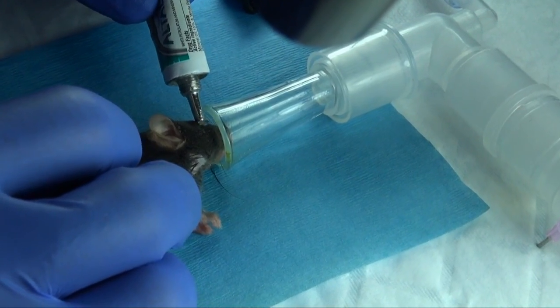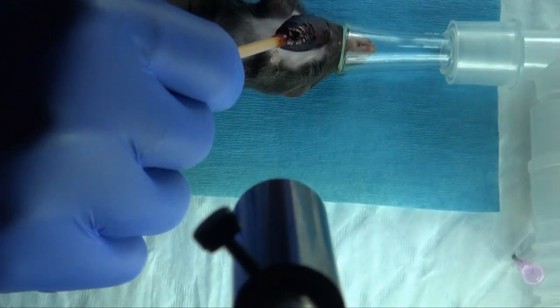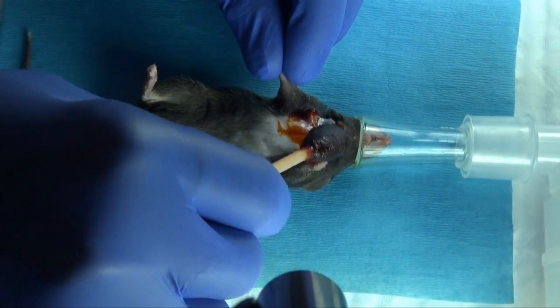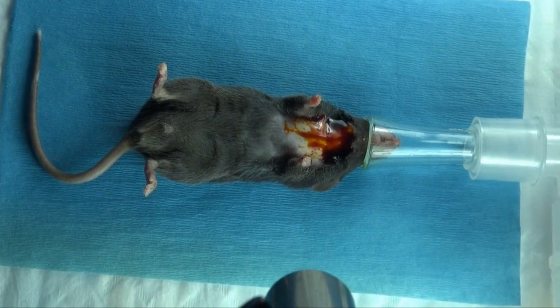Prior to the procedure, apply protective eye ointment bilaterally. Swab the skin with povidone iodine solution, followed by 70% isopropyl alcohol.